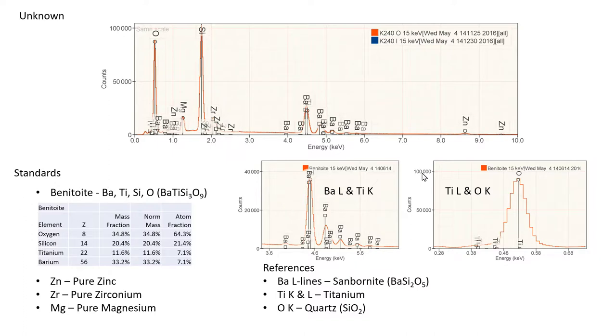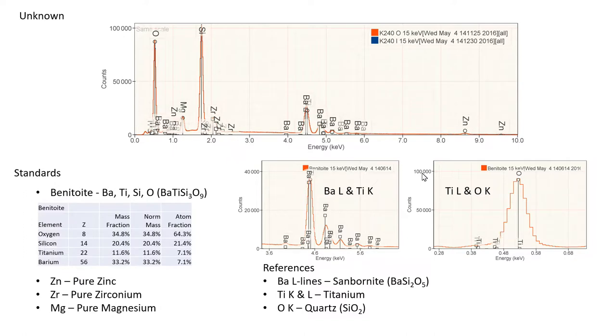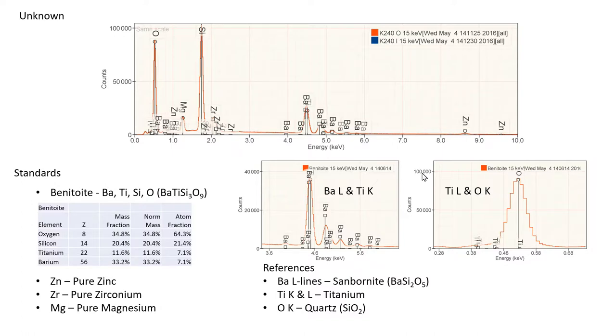There's some other elements in there too that we're going to be considering: zinc, zirconium, and magnesium. Our strategy is going to be to take standards collected from these materials and convert them into standard bundles. To make use of the Benitoite, we're going to have to include some additional data in with that standard. These are what we would call references, which are essentially the way that we deconvolve the overlaps in the Benitoite so that we can make use of it as a standard.